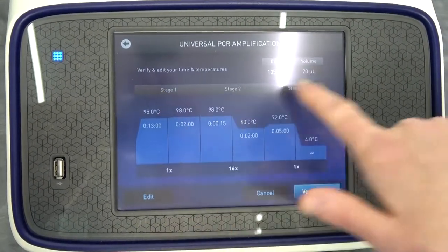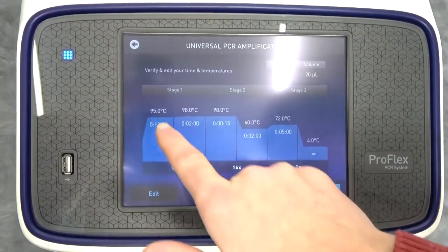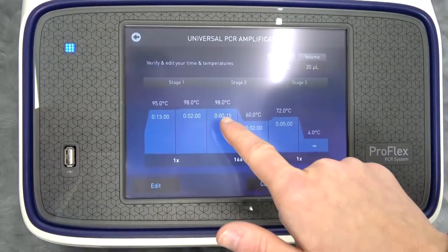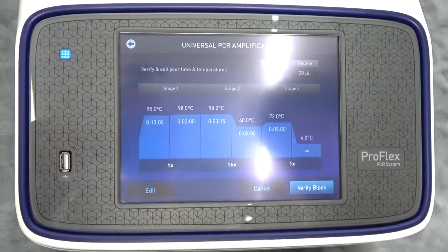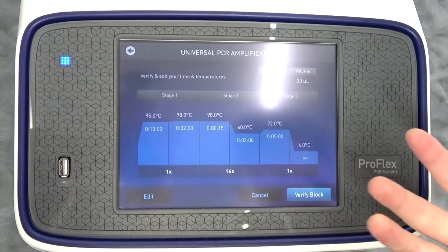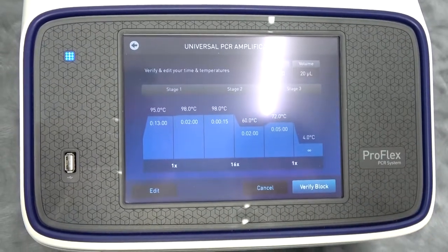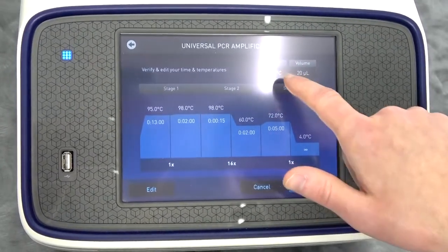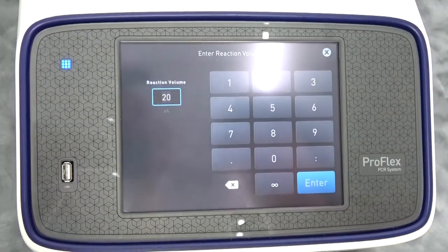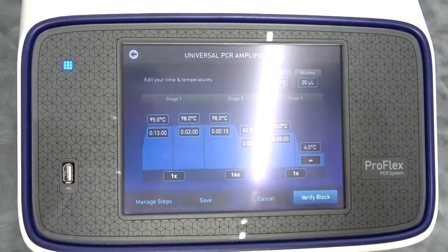It's going to show you your three stages in the method, as well as the different steps in each stage. It shows you the temperature it's going to run at in each step and how long it's running in each step on a chart. Below, you'll see how many cycles it's going to do at each stage — that's the usefulness of a stage; you can repeat stages and have multiple steps. You also set the cover temperature and the volume of the reaction.